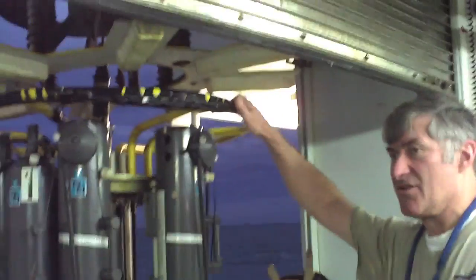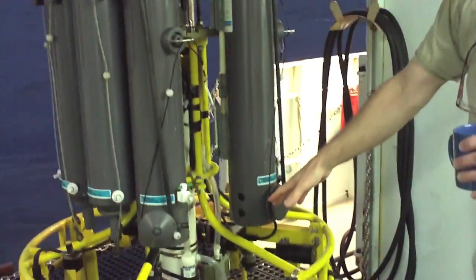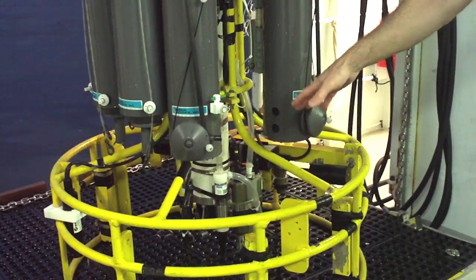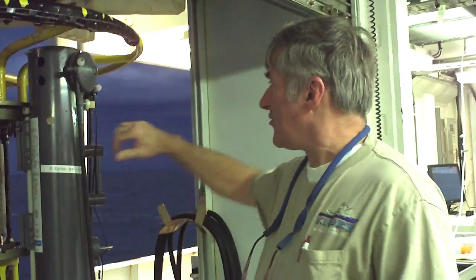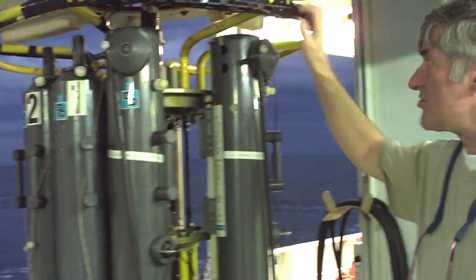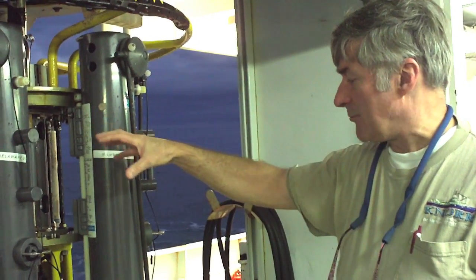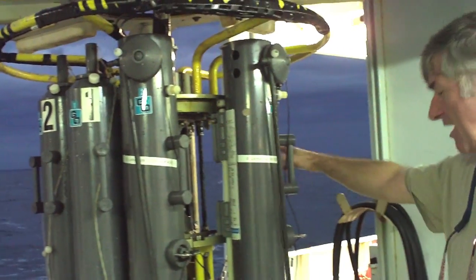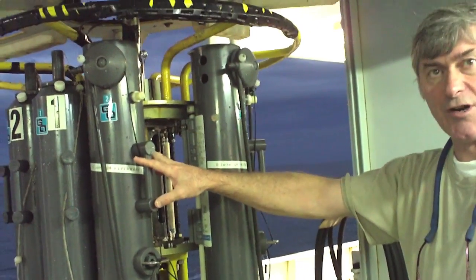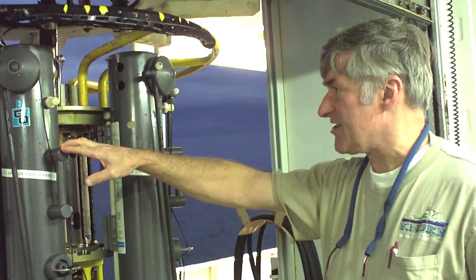So the CTD is one of the key instruments of the vessel. It has sensors for oxygen, temperature, depth, salinity, fluorescence — usually used to measure chlorophyll — and a few others. And then these bottles are on the rosette. So as you go down into the water column, you see features and then you decide where you want to take your samples. As you can see, we have six Niskin bottles and three go-flow bottles. Go-flow bottles are for trace metal work, but we're just not doing that on this cruise because we just had them back in for refurbishment for testing and they're working fine.